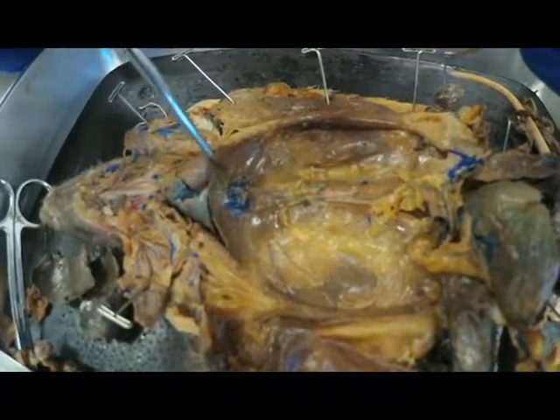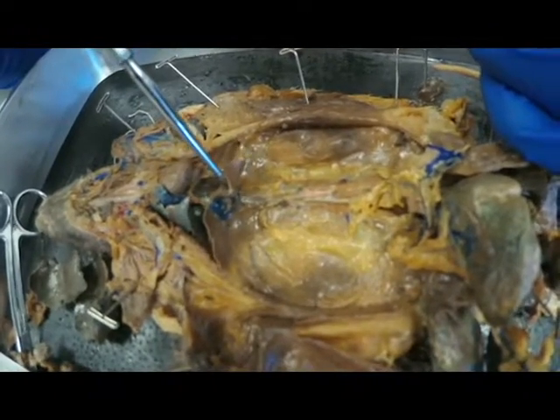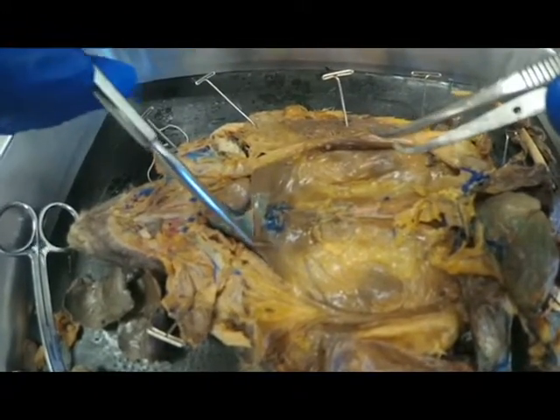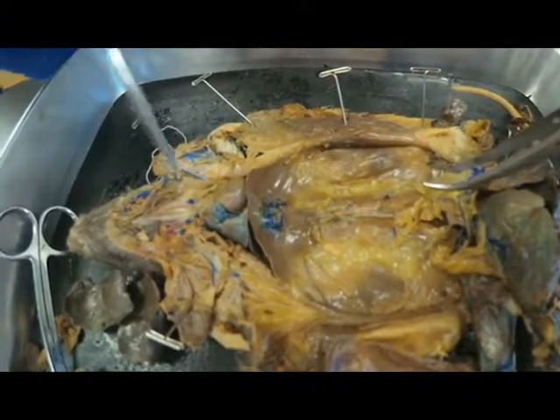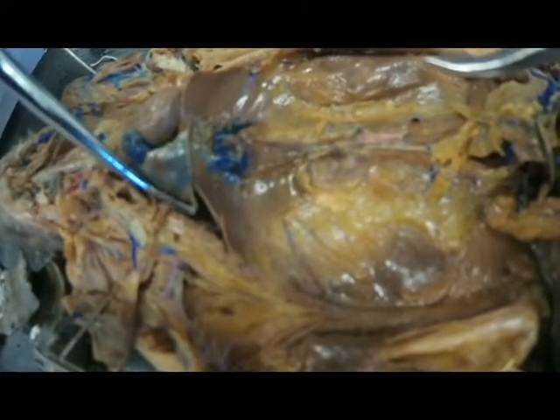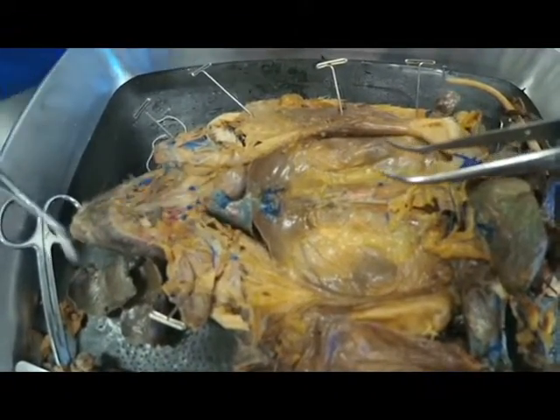Also, here we have the diaphragm. It's just a muscle that is going to act like a vacuum. So when it is pulled down like this, the lungs will bring air in, and that is inhalation. And then whenever the muscle is going up here like this, it pushes the air out, and that's exhalation. Also, the rib cage, you can kind of see the remnants here of what's left, what hasn't been cut open, and those will expand and contract, and the muscles in between each rib will allow that to happen.